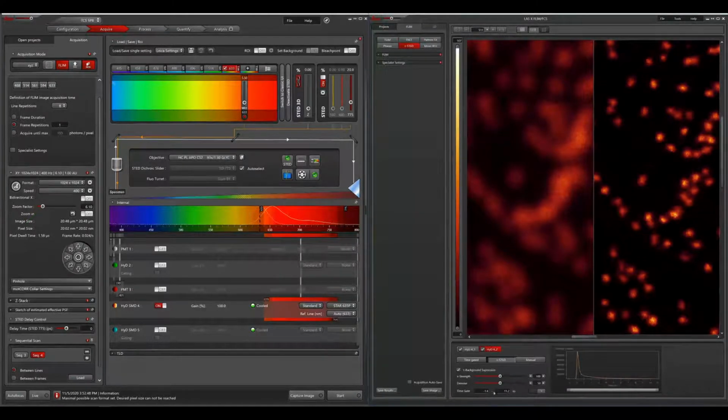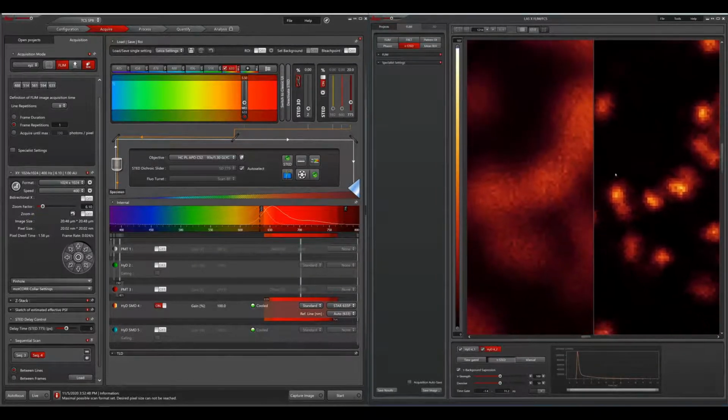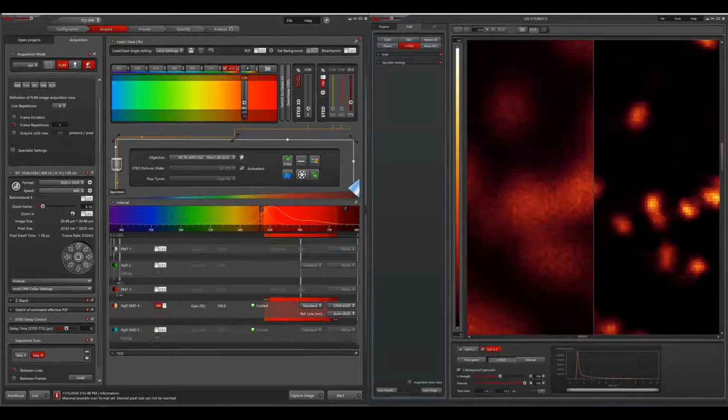There is a second one called Denoise, which if you zoom in closely, you can see what it's doing. So again, the default value of the slider is 50. If you want to create really the publication result, you can just pull the slider over to the maximum number, 100, and you can see that it's denoising the signal nicely, but not doing anything with the resolution or the intensities as such, just creating a nice denoised image.